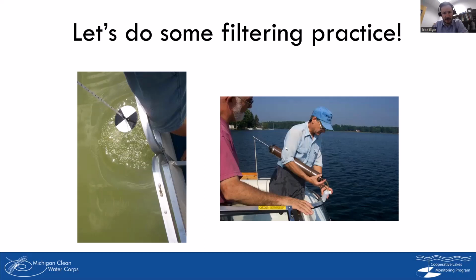So this is in regards to the 50 cc's of lake water. So you are actually counting bits of algae per 50 cc of lake water, or bits per less than 50 cc of lake water? So it's a 50 cc. Counting bits is probably a simplification.